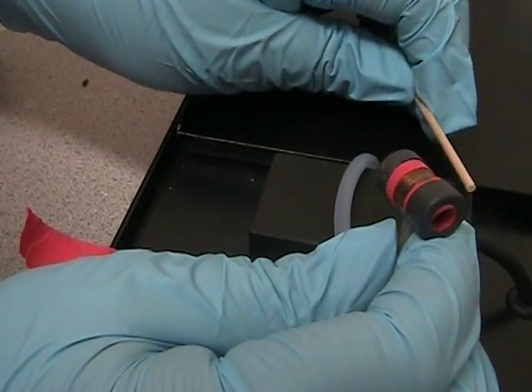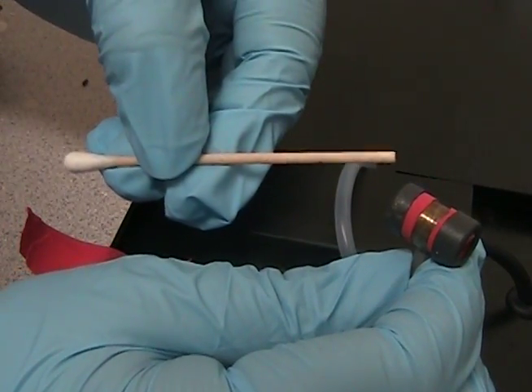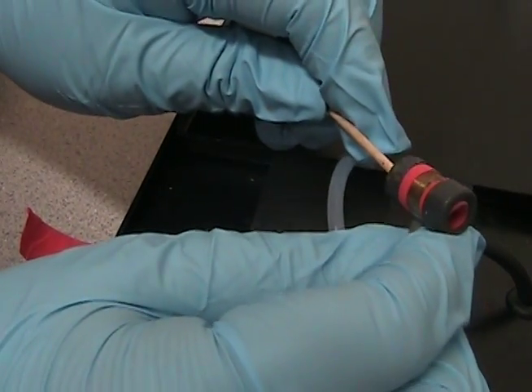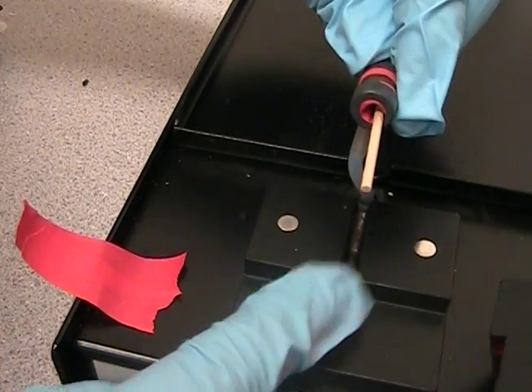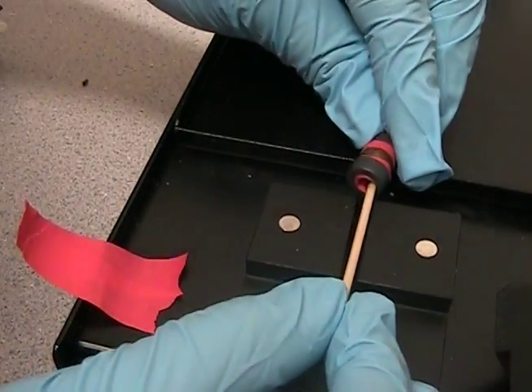Now we're going to demonstrate how the tail is used to take the blood pressure. We're using a Q-tip. We place the Q-tips through the tail cuffs and place it down in between this area, like so.